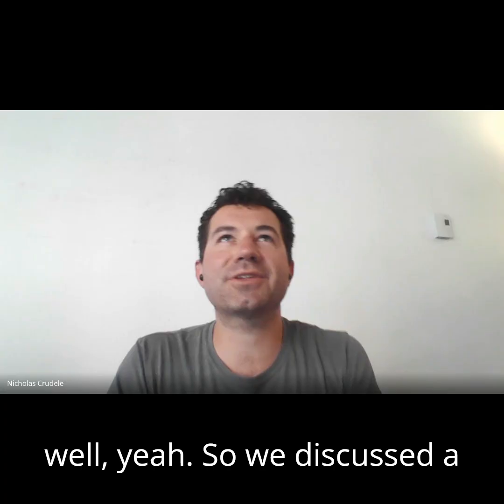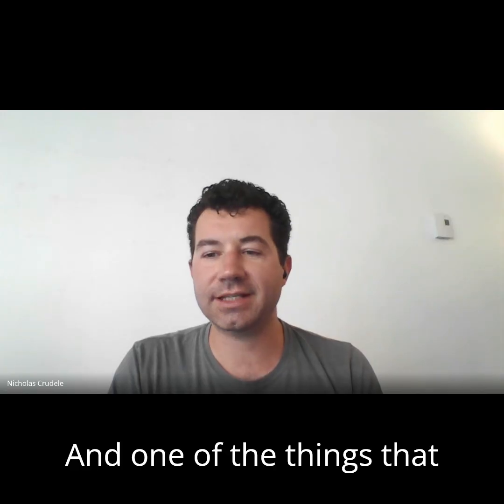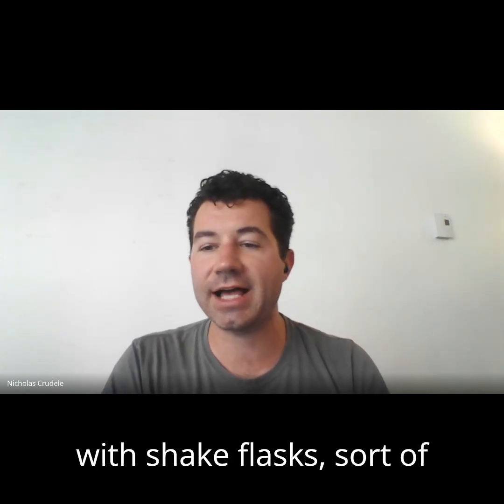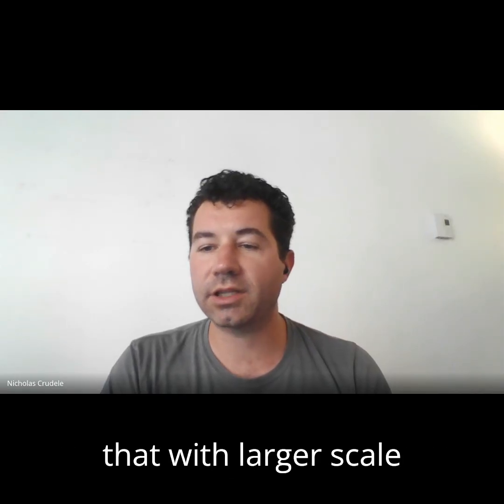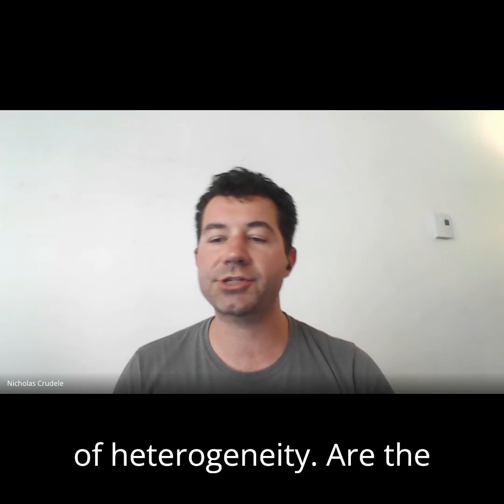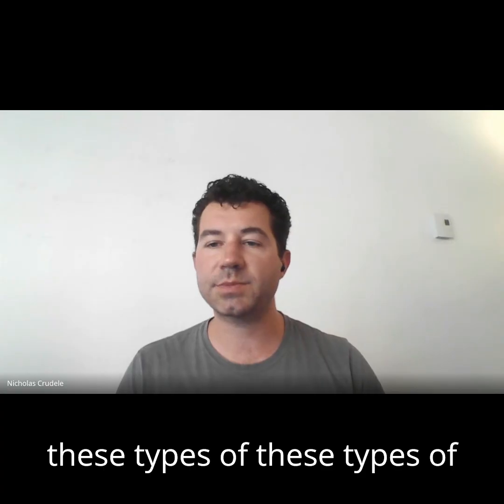Okay, so we discussed a little bit about engineering numbers like Reynolds number, and one of the things that has come up in a few of these conversations that seems to be a challenge with scaling is homogeneity and mixing. So my understanding is that with shake flasks, dissolution and mixing happen very effectively, and that with larger scale reactors, you get these pockets that may lack oxygen, and there's some sort of heterogeneity. Are the current systems like digital twins very good at modeling these types of things?